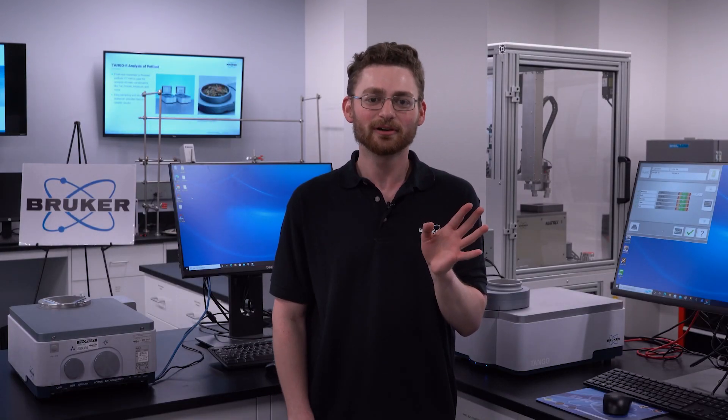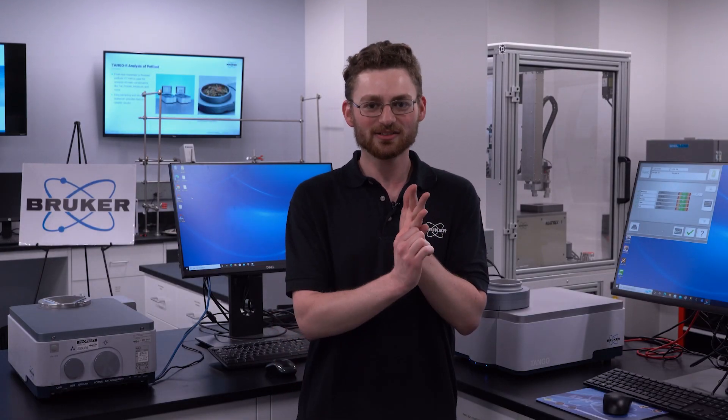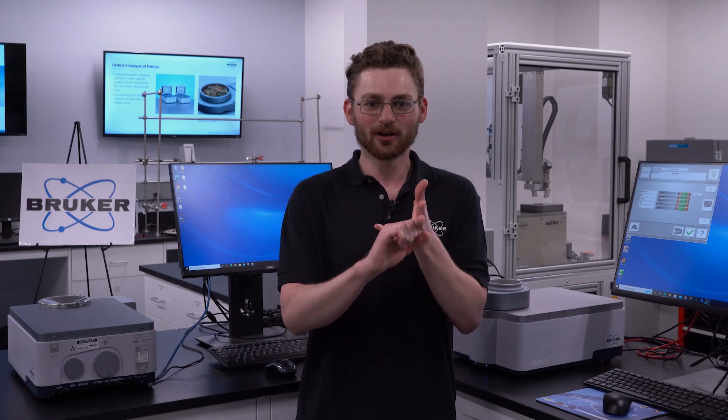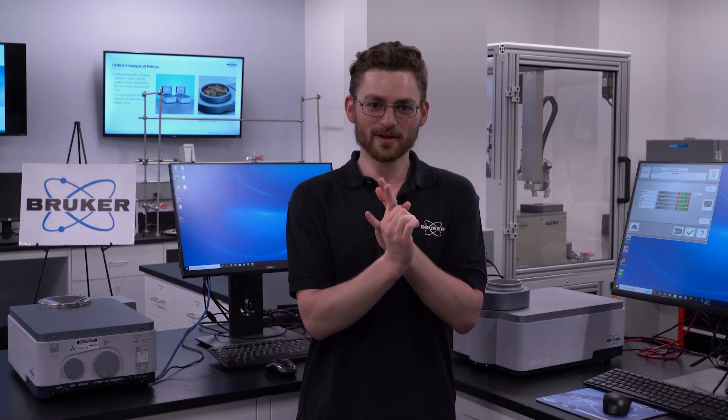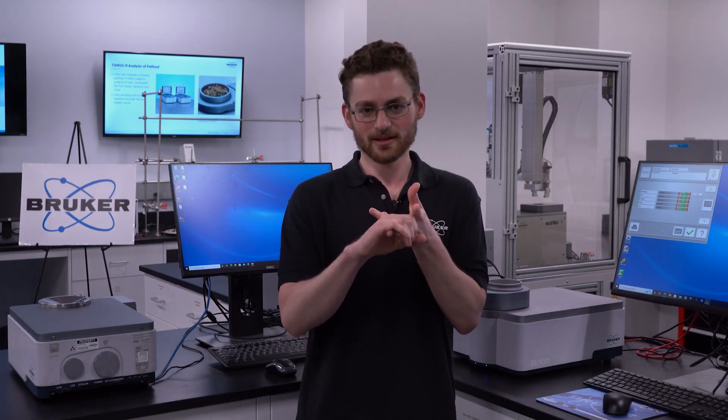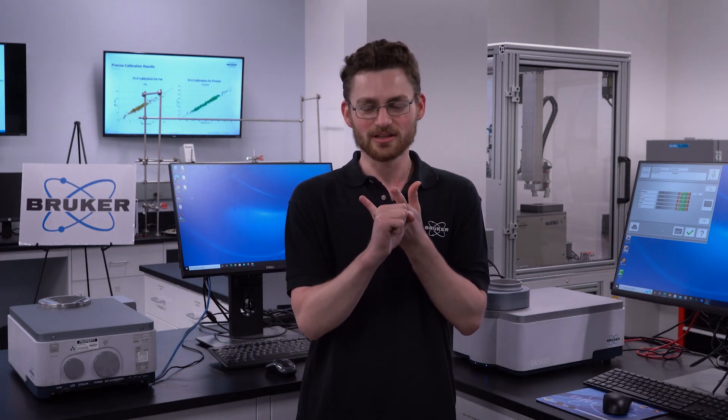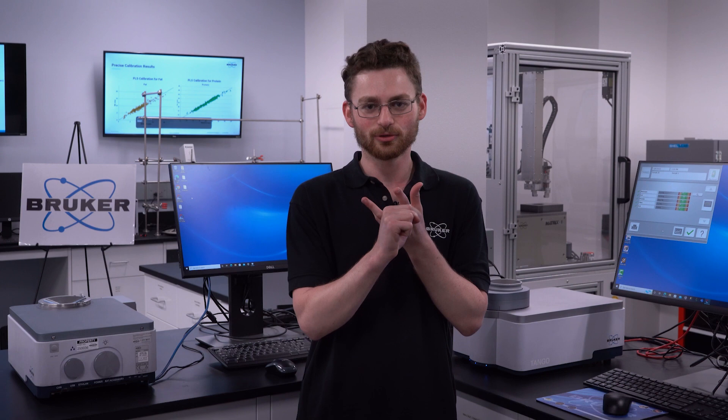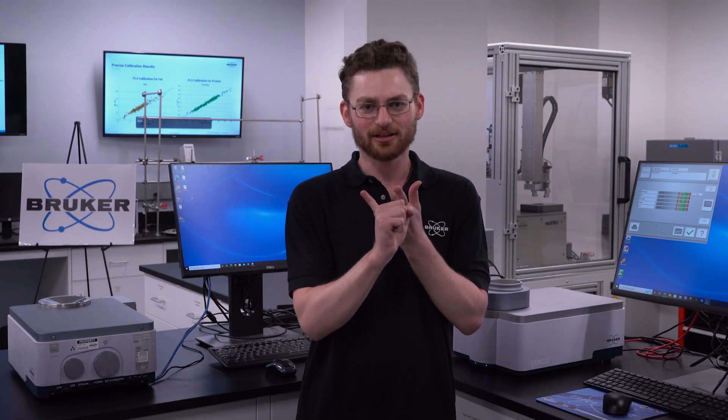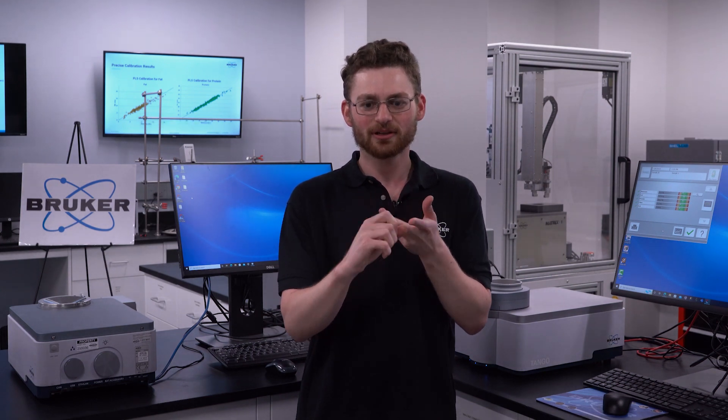Five features of the Tango that make it unique and superior are that it's quick and easy to use, all tangos are out of the box the same, the calibrations are reliable, easily transferable, and give accurate results.